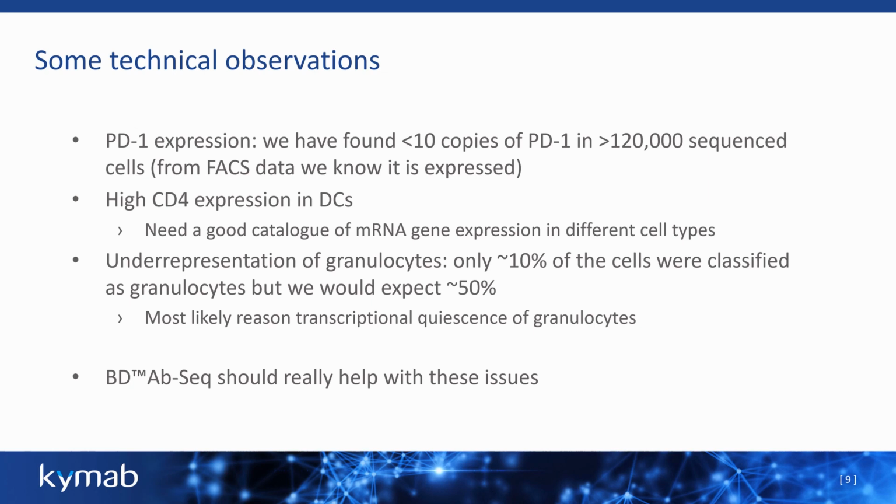Obviously, in FACS, these DCs are dim, not negative, but dim for CD4. So there are obviously post-transcriptional regulatory signals after the mRNA is actually synthesized.